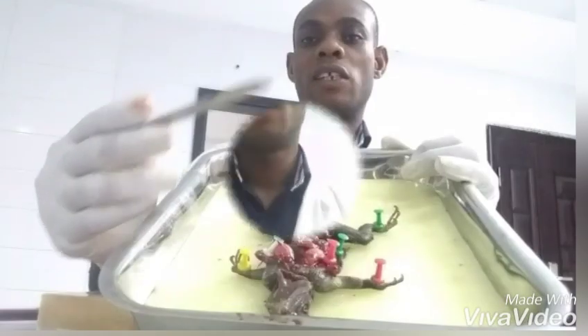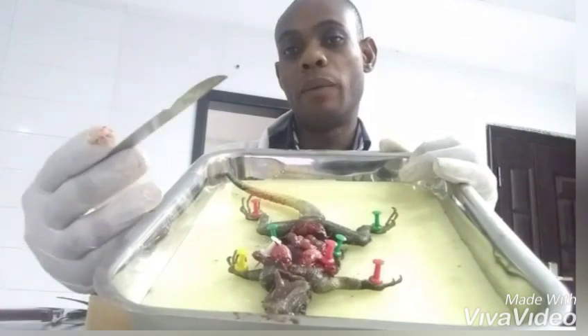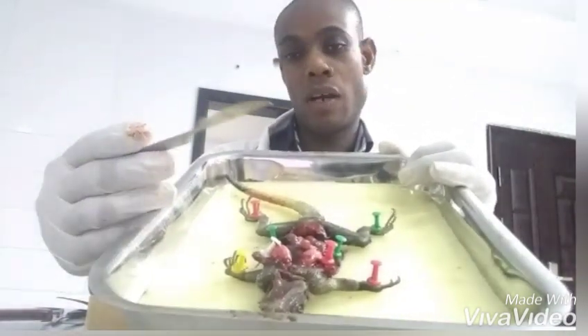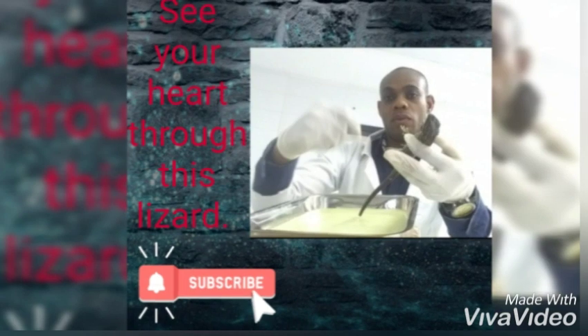Hello and welcome to Science Lab Studios. Today we are here to do a dissection — we are going to be dissecting a lizard. Maybe you want to know what is in a lizard. You want to see the internal organs, study about the heart of the lizard, look at the lungs, and see how the organs are arranged. You can actually dissect the lizard and get to know about it.